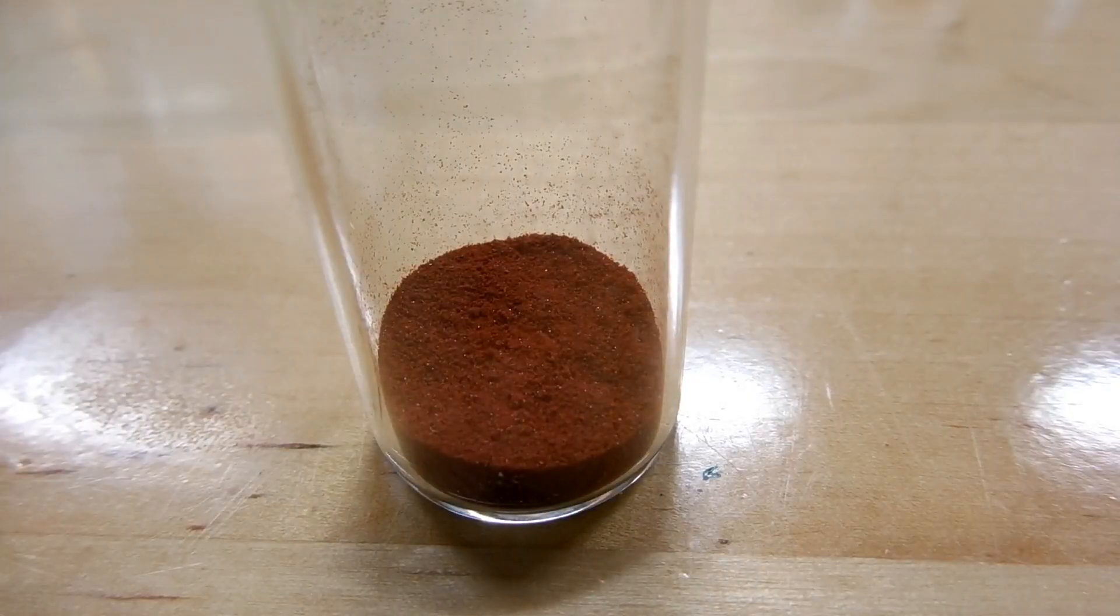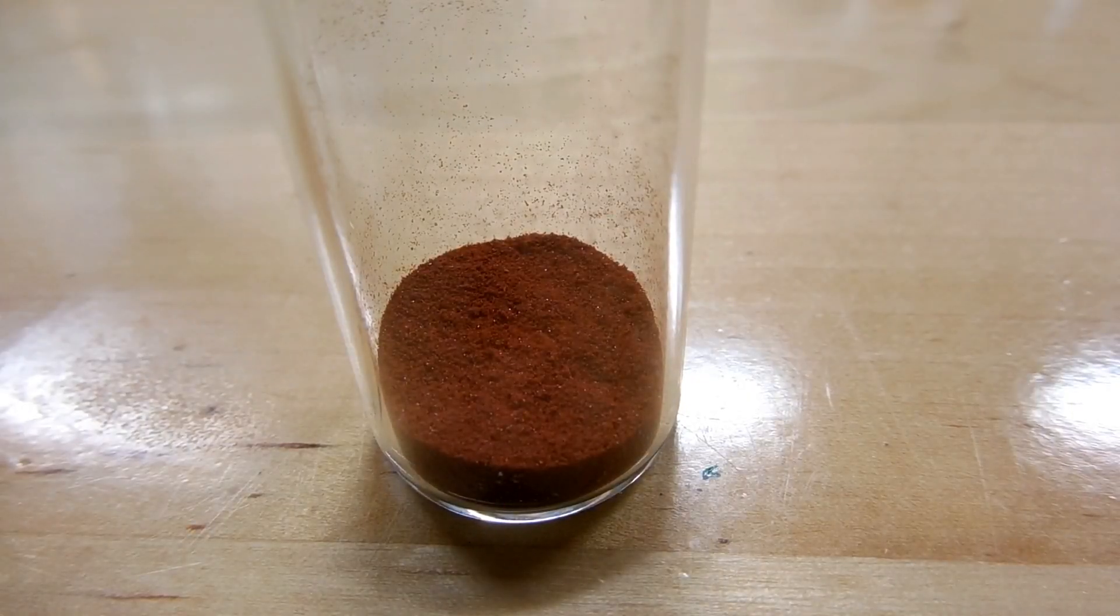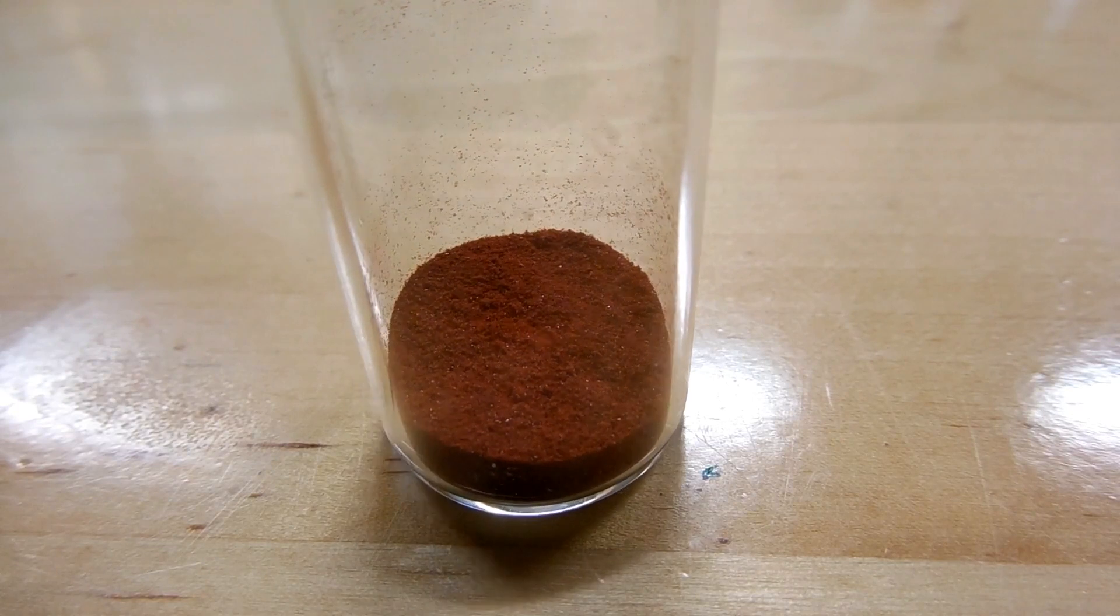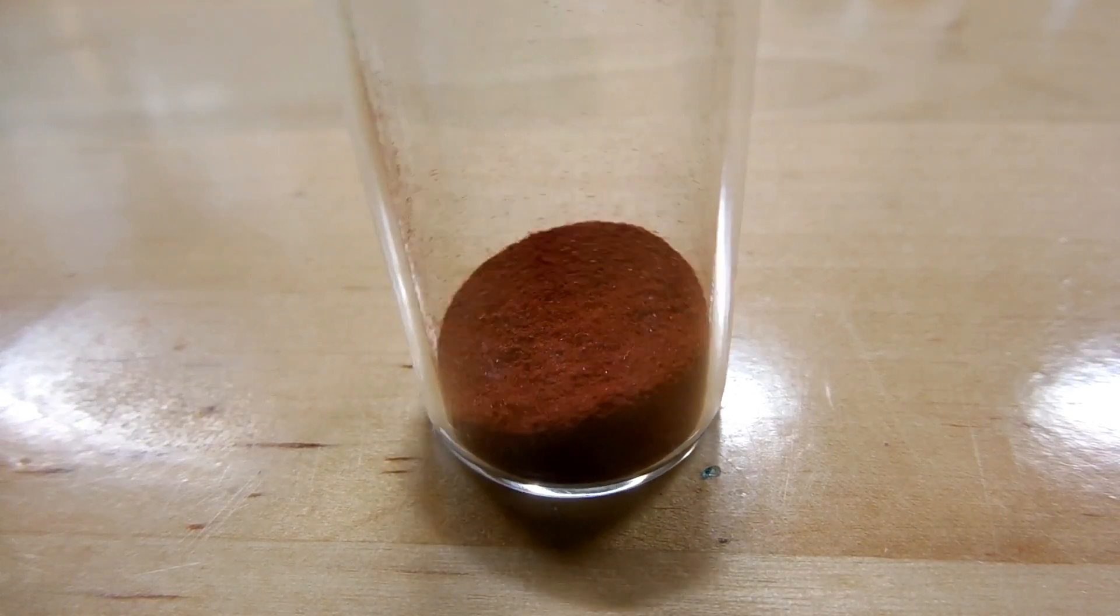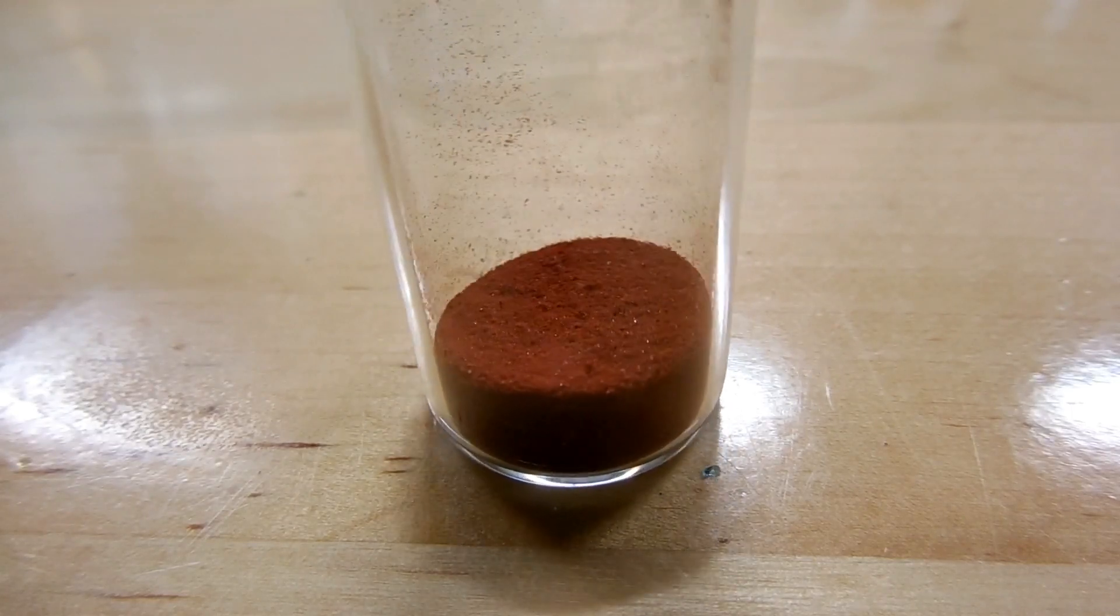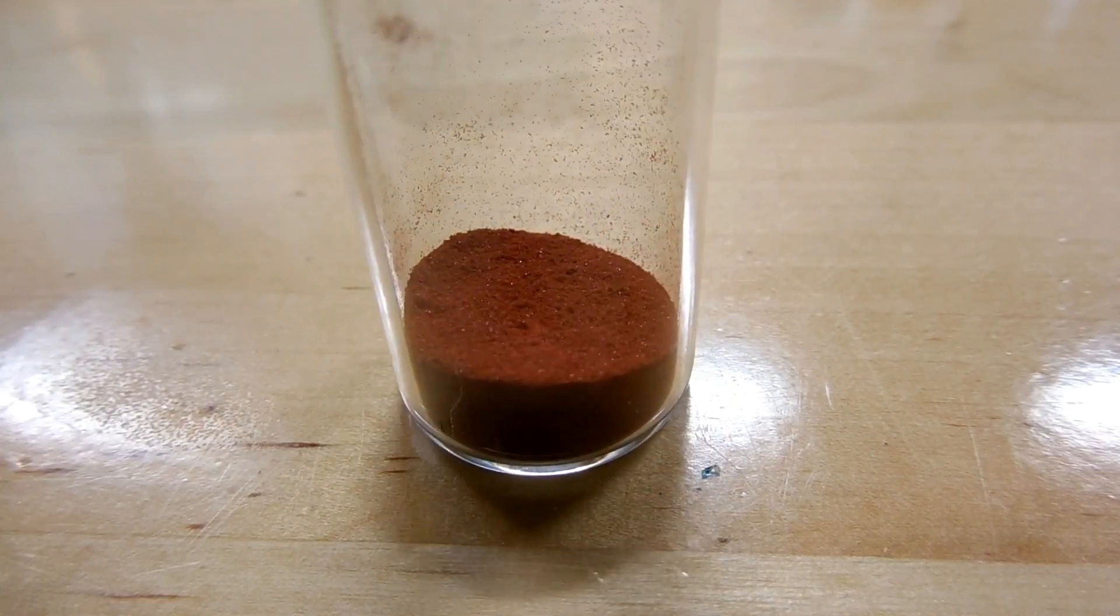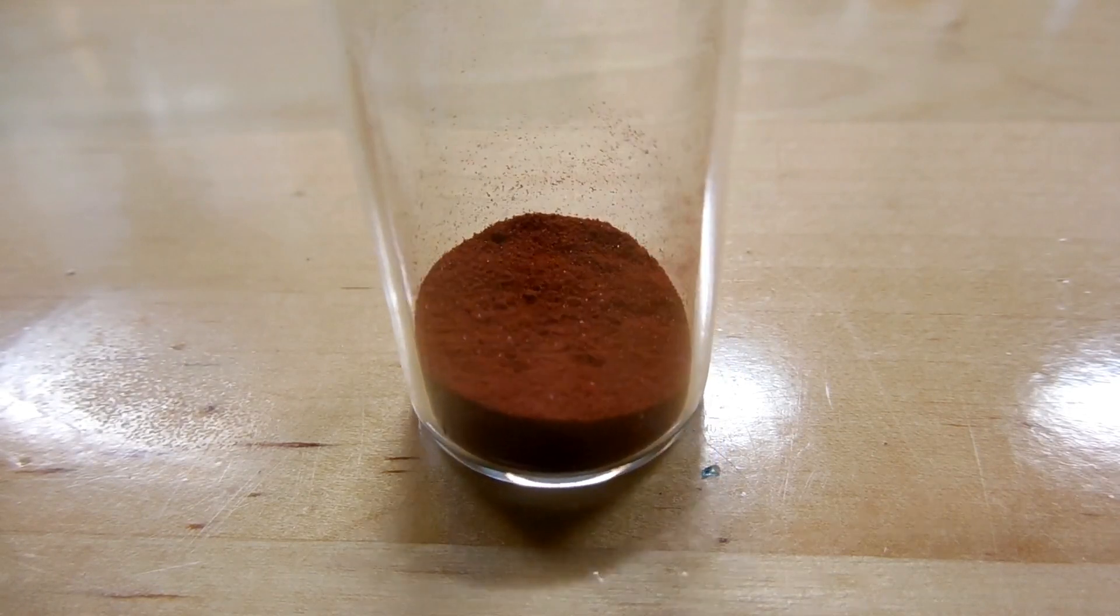So there you have it, preparation of Chevreul's salt, a red copper compound that is a mixed valence sulfite starting with a blue solution and a colorless solution creating a green solution and ending with a brick red precipitate. Really beautiful copper chemistry.